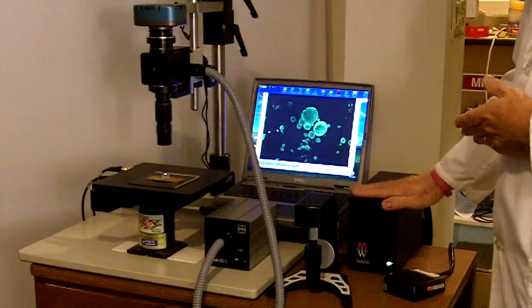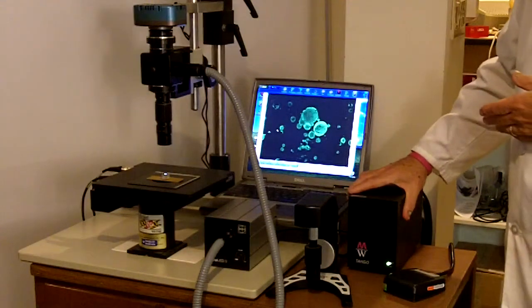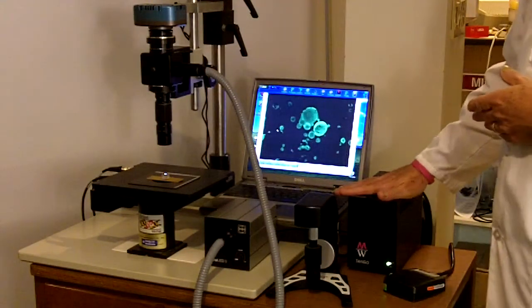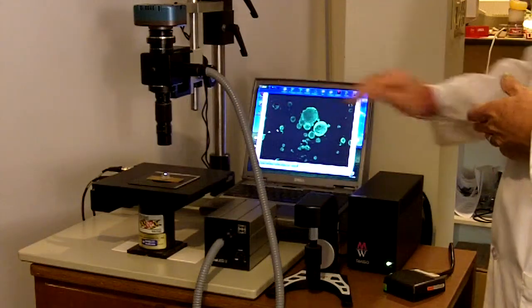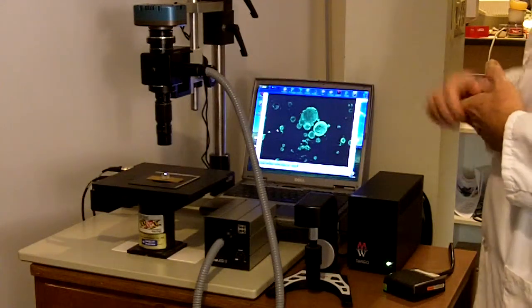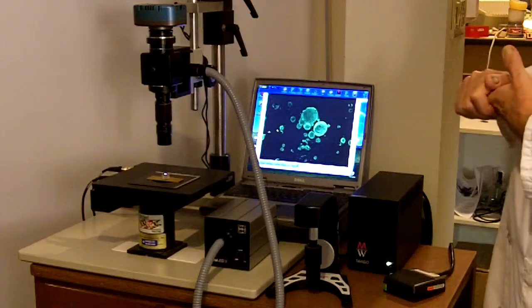The box that you see here is the Tango box from Mertzhauser. This is used to control the hand controller, the X, Y, and the Z on the microscope itself.